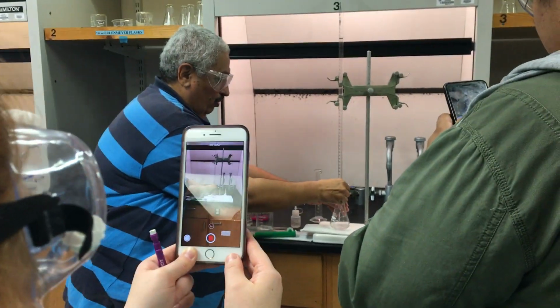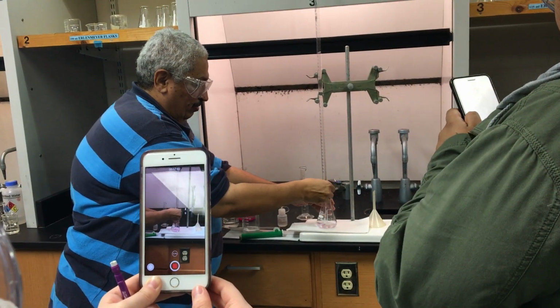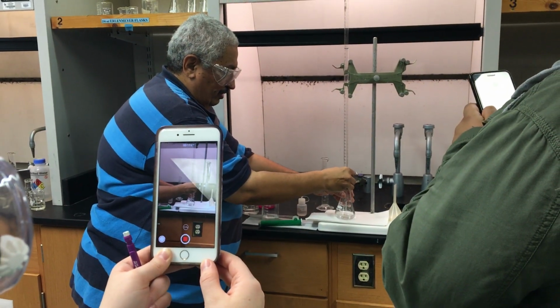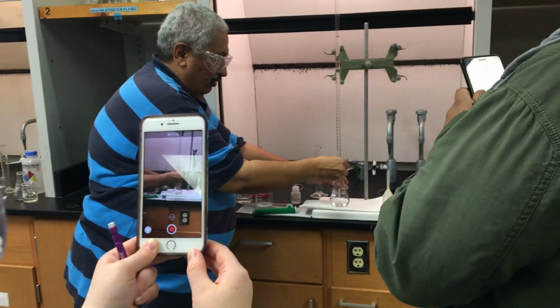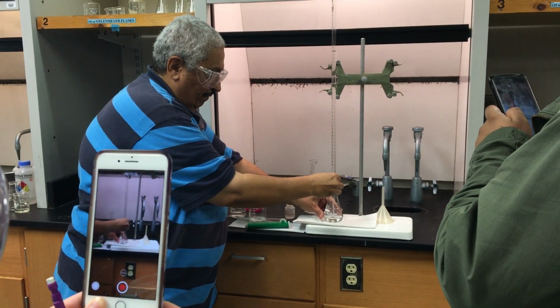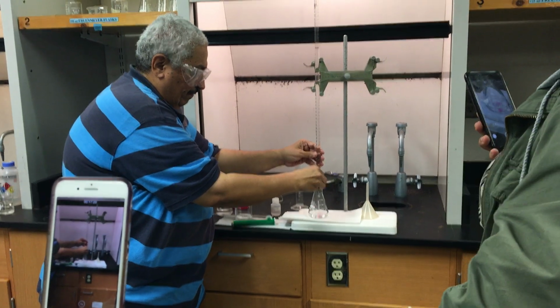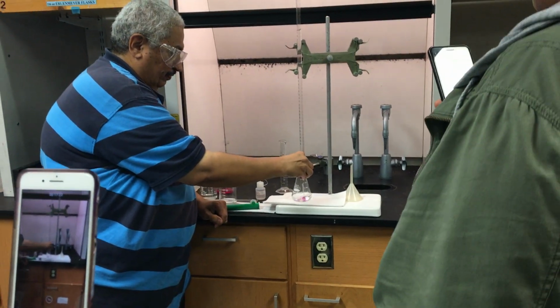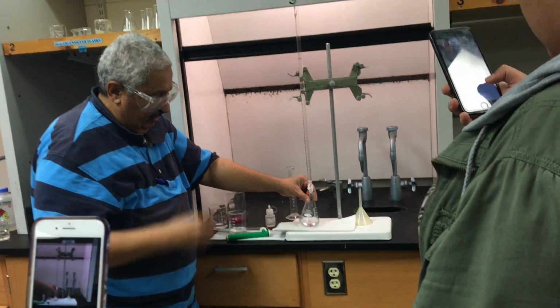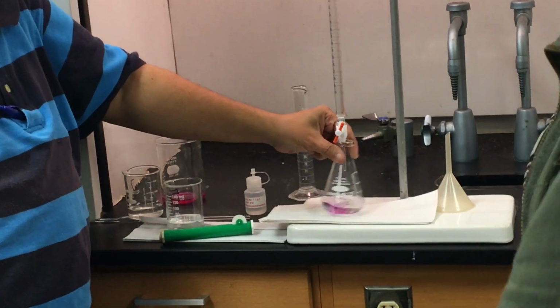So I'm adding more, and you'll see the color will persist after a while. Adding more, adding more. See here the color? Now the pink color starts. So now I'll add just dropwise. Okay, here it is, one drop at a time. See here, one drop at a time, guys. And when the pink color remains, I stop. That's my end point.